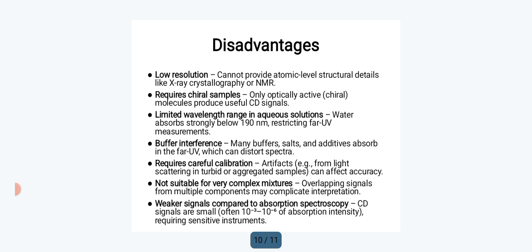which can affect the accuracy. Next, it is not suitable for very complex mixtures, where overlapping signals from multiple components may complicate interpretation. And weaker signals compared to the absorption spectrum: the CD signals are small, about 10 power minus 3 to 10 power minus 6 of absorption intensity, which requires sensitive instrumentation.